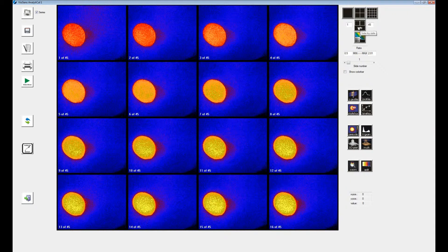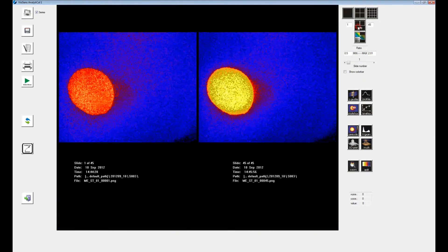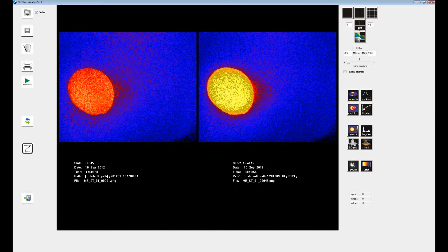In the side-by-side view, two images can be displayed next to each other. Here the first and last image of our time series measurement are displayed. You can find the respective image information below. To compare other images, you can type the respective image number next to the side-by-side icon and then click on it.